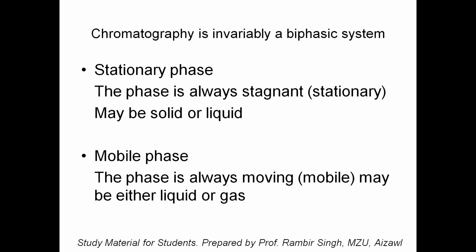Carbon dioxide is pressurized, and it will be converted into a liquid. When the coffee beans are in liquefied CO2, the liquefied CO2 will extract caffeine from the coffee beans. And then, simply using a wire gauze, you move the coffee beans up and leave the solvent at the bottom, right?